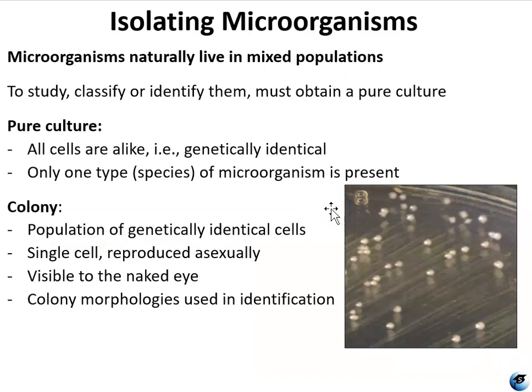So speaking of having only one colony type, if you have a mixed culture, which a lot of times you will, because in nature, bacteria live in mixed cultures. They don't just hang out with their own kind. They're all swimming around together, right? So you have a mixed culture that has more than one species in it.